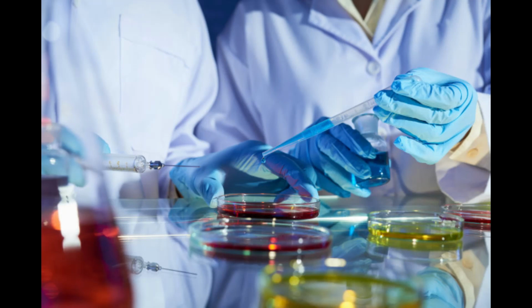So do you already see how, if you grew this, quadrant 1 would have a lot of growth and quadrant 2 would have less, because you're only pulling some of what's in quadrant 1 over. Throw that loop away. Get a third sterile loop, come down to your third quadrant and do the same thing. Go over here and pull over from the first one and streak a third quadrant. Pull from the second quadrant. Throw that loop away, get a fourth one. And I've not done this well because I can't turn the plate. And then you streak from that one and pull it over.